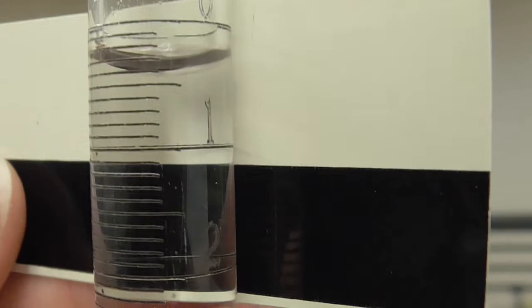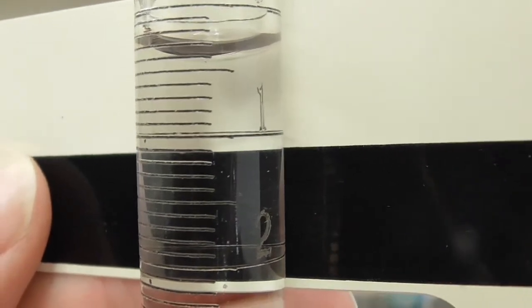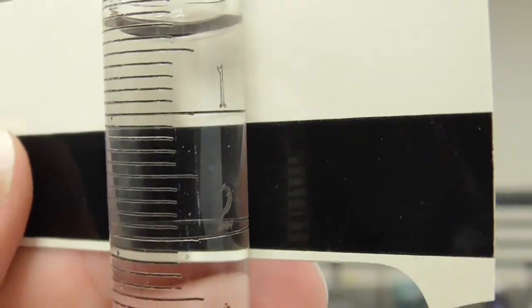So let's see if we can read off the value off the burette here. Okay, let's see. Actually, we have to turn this around a little bit. Okay, there's the beginning point for this first titration. Pause it.